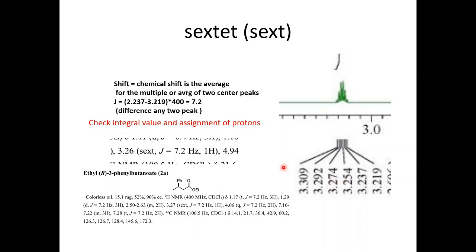This is a 400 megahertz spectra. That's why I multiply it by 400. Sometimes I have spectra which are 300 megahertz. Sometimes I also have spectra at 500 megahertz. Then according to that you can multiply this. You can take any difference but take care - sometimes it has experimental error, so match with other peaks.